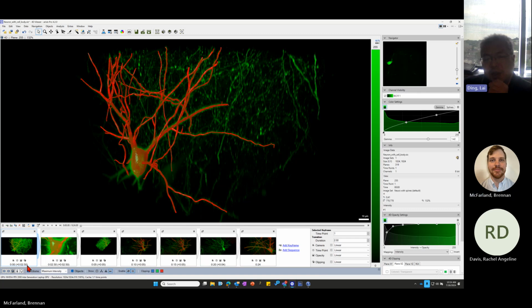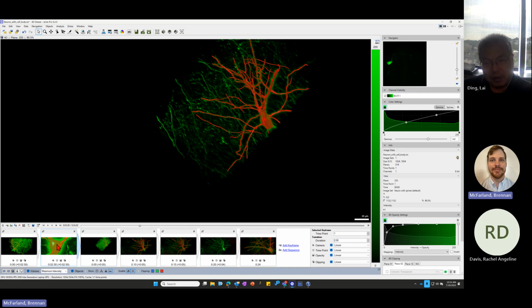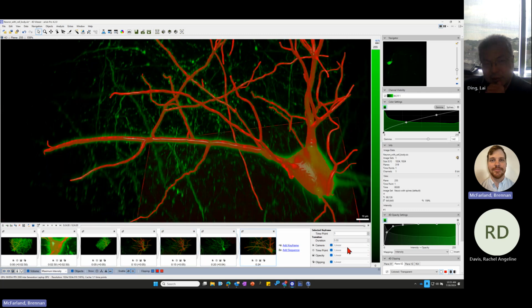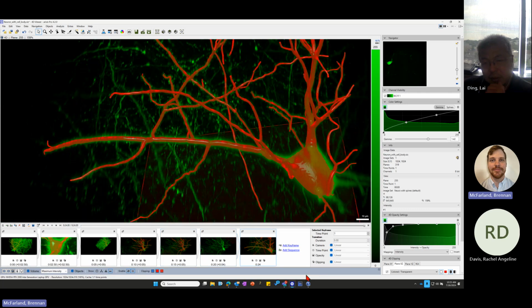But if we separate it into two durations, the first one is go fast, and the second one is go slower, I have more control on it, right? Yeah, that's why you'll have to decide between your keyframes how you want to set that up. Right here I have it accelerated for this keyframe, but for the one before and the one after, it's set as linear. So it'll move through in this 4-second time period. It'll accelerate in the beginning, but because we have it linear beforehand and linear afterwards, it's probably going to get lost in the mix.